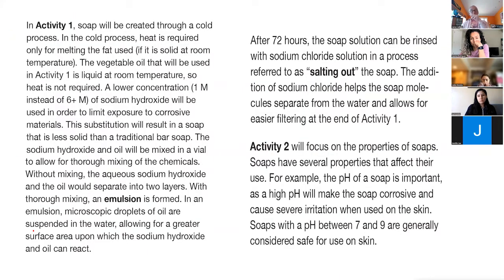So we're going to be doing 2 activities today. One, we're just going to start activity 1. We're going to start making our soap from vegetable oil. So it's a liquid at room temperature, so we don't have to melt it.